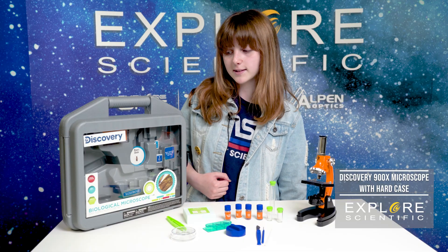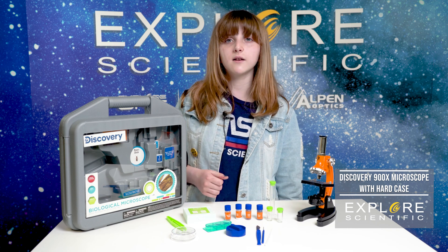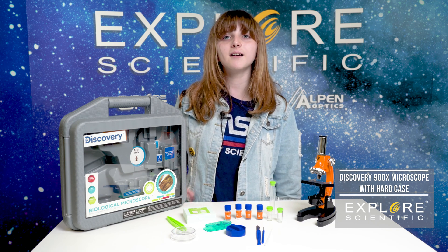I'm Levine Nassar from Explore Scientific and this is the Discovery 900x Biological Microscope. Keep on looking up.